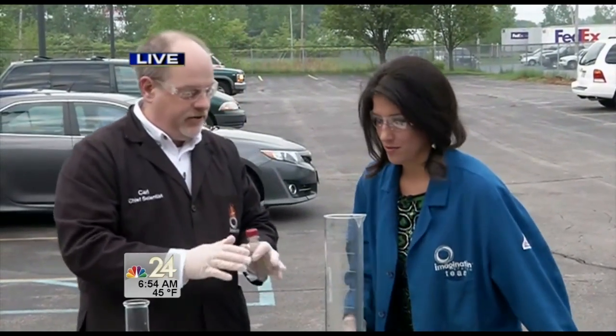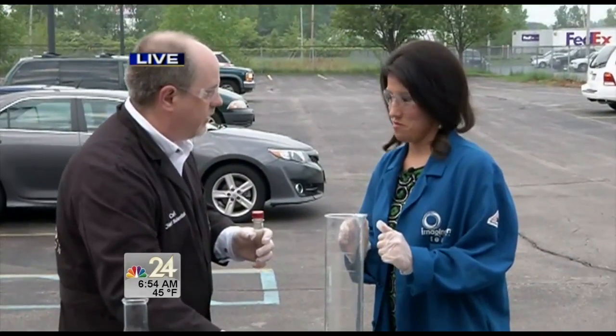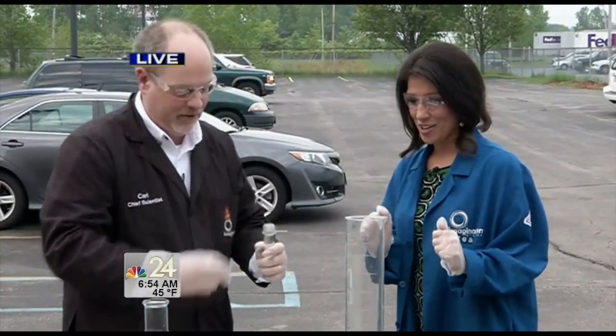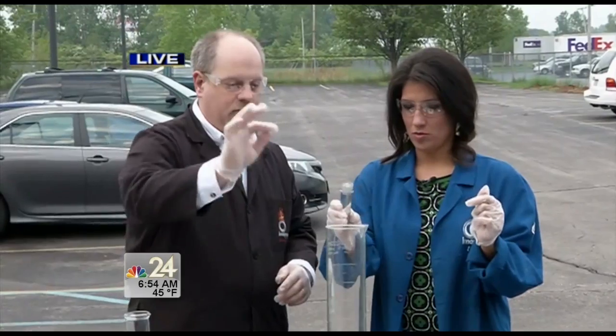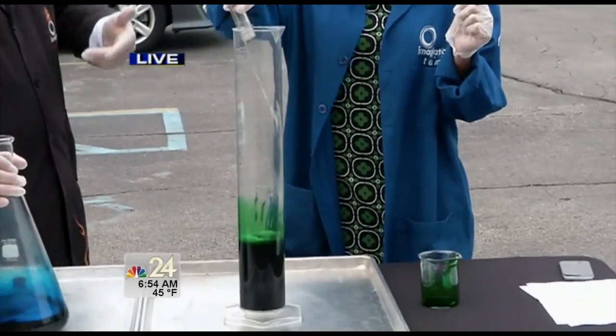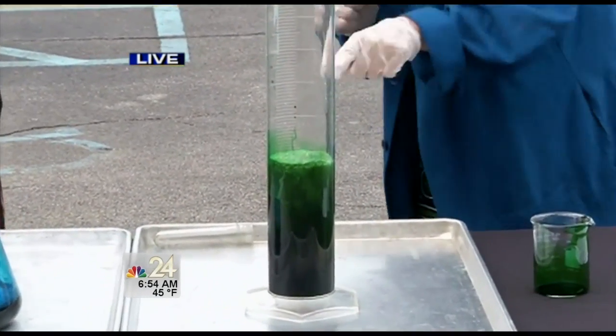But if we add a catalyst — some potassium iodide — we're going to very quickly break down that hydrogen peroxide and get a ginormous reaction. Let's just do it and find out. Give it a countdown: three, two, one — pour it in all at once. What that's going to do is break down the hydrogen peroxide inside there.